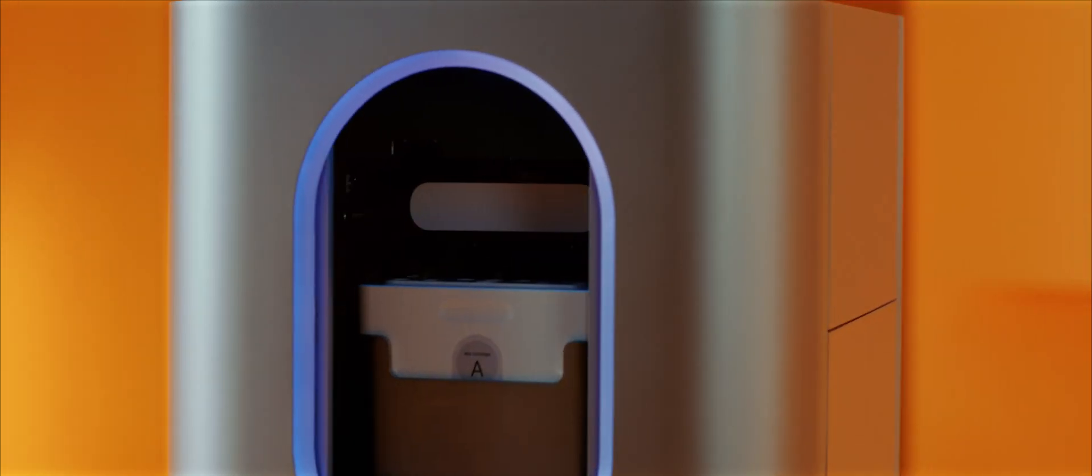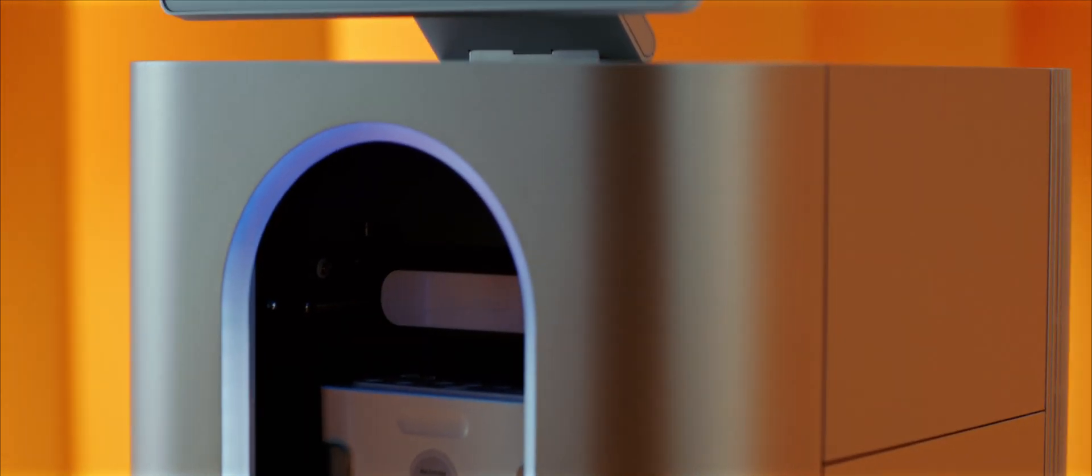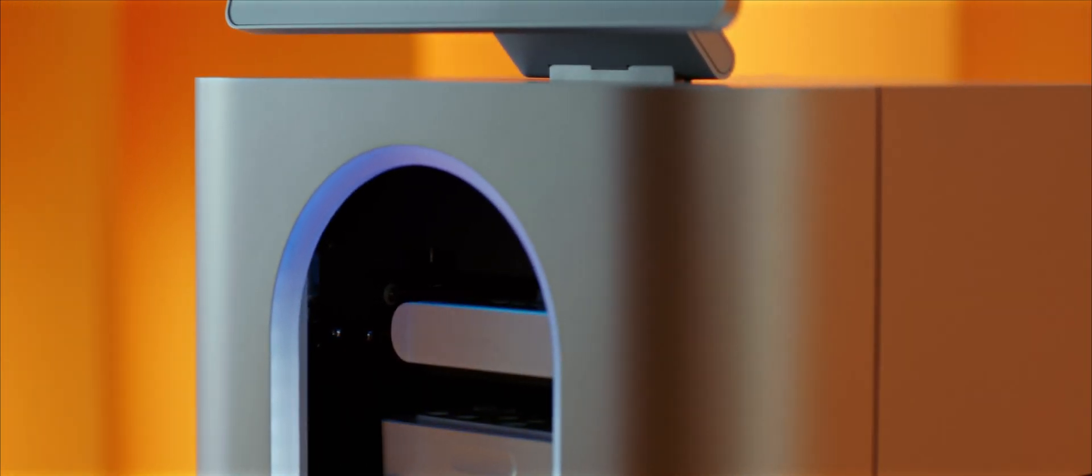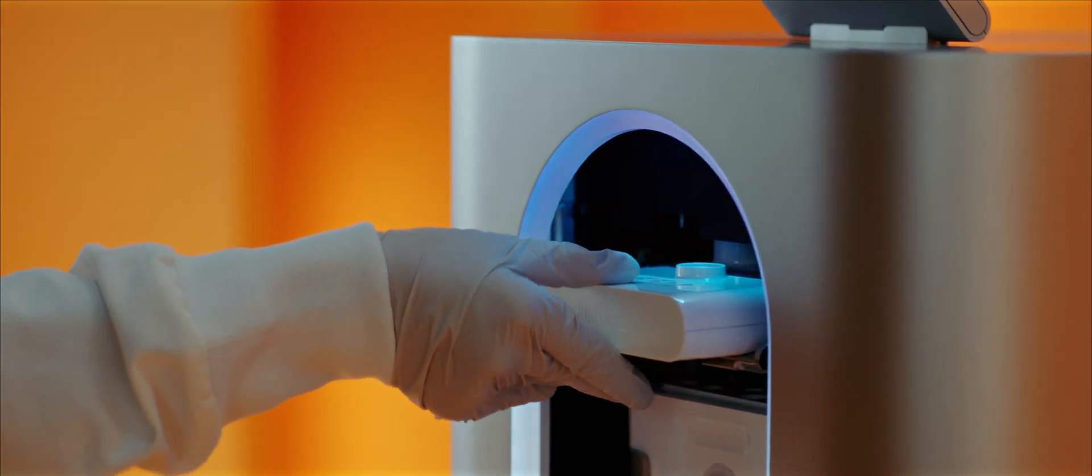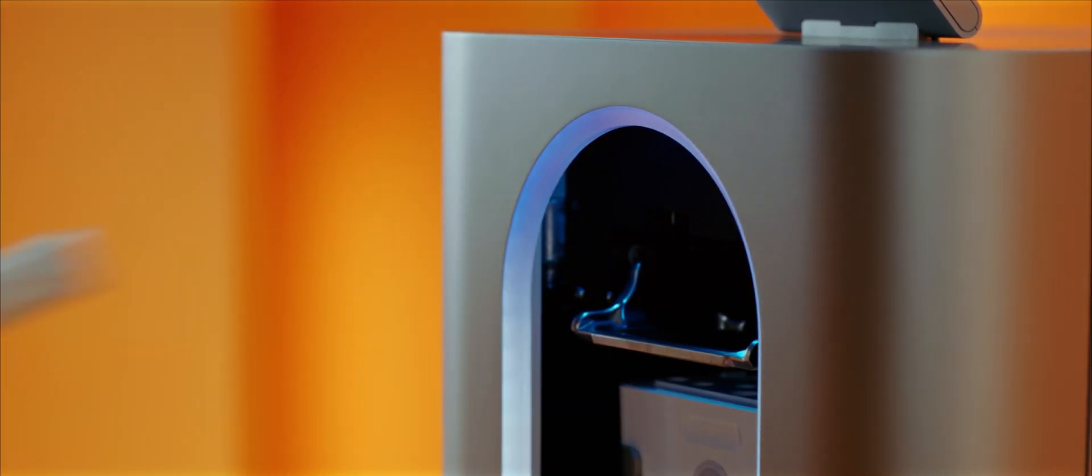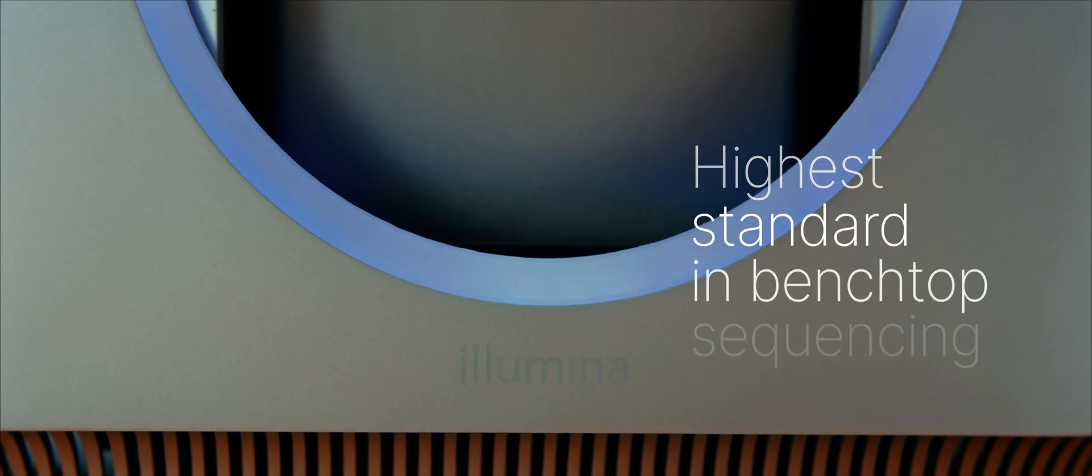Following the completion of the run, remove the cartridges from the instrument. The cartridges can be easily disassembled and a majority of the components can be recycled.